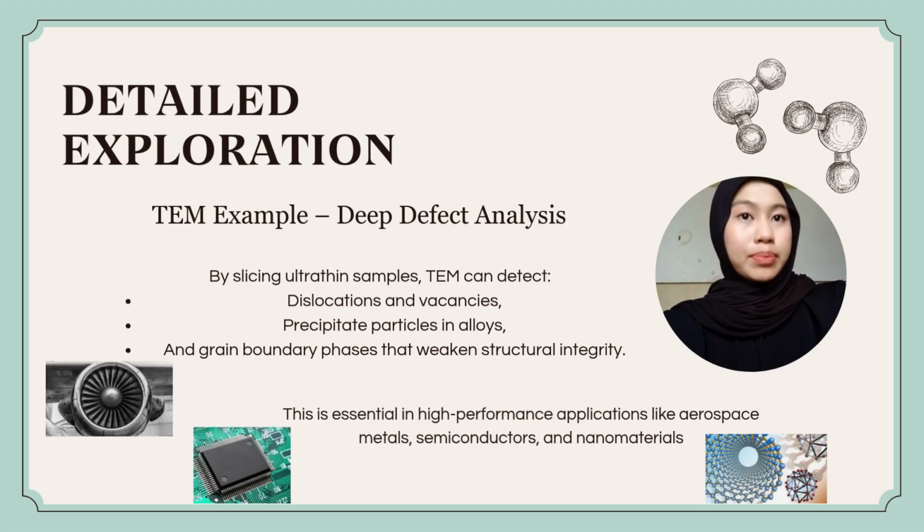TEM allows us to go deeper inside the material. By slicing ultra-thin samples, the TEM can detect dislocations and vacancies, precipitate particles in alloys, and grain boundary phases that weaken structural integrity. This is essential in high-performance applications like aerospace metals, semiconductors, and nanomaterials.